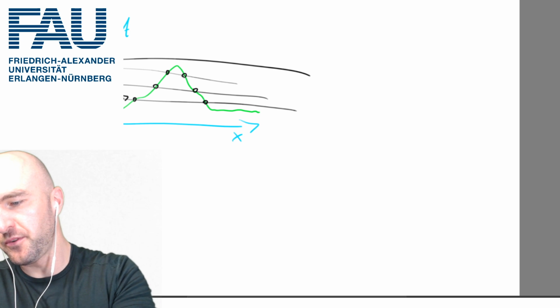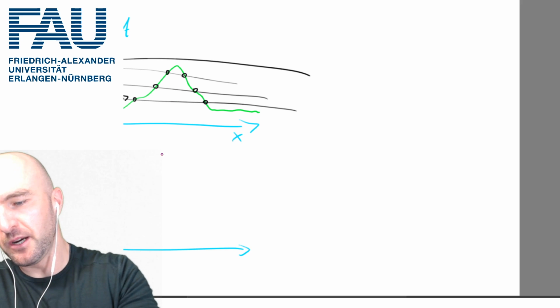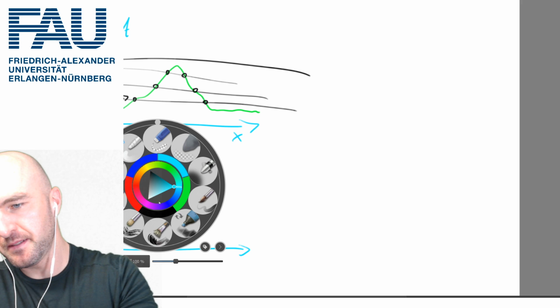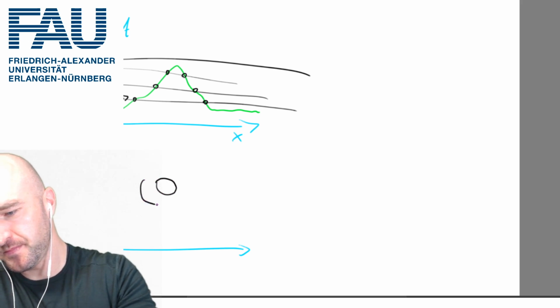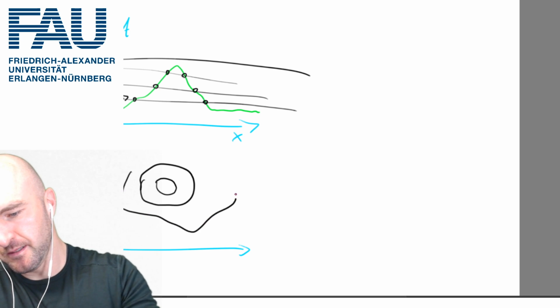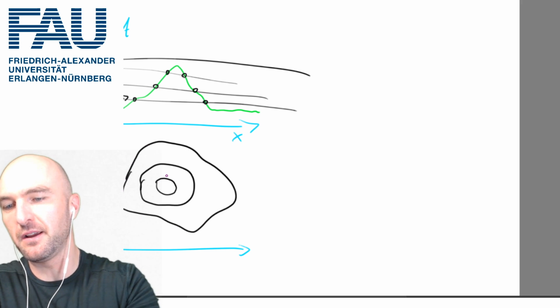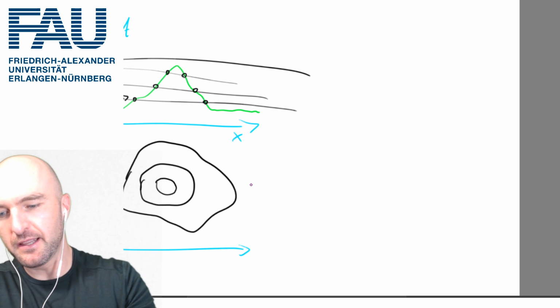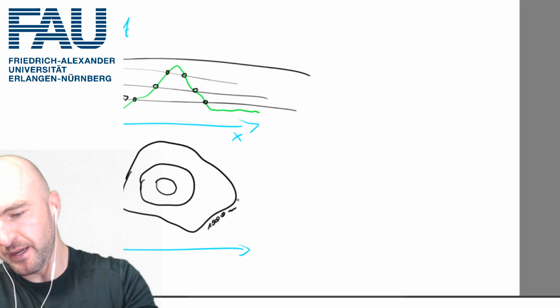Obviously, if you look from the top, the whole thing is going to look more like this. This is maybe what your mountain looks like, the outline that you have from the top. And so this was our 1,000 meters line, our 2,000 meters line, our 3,000 meters line.